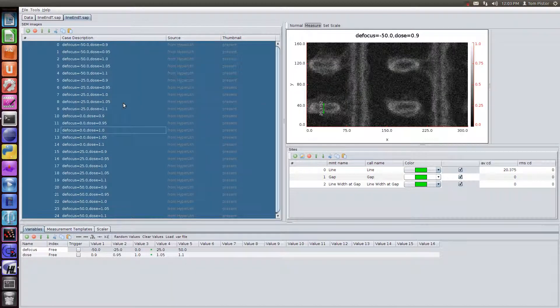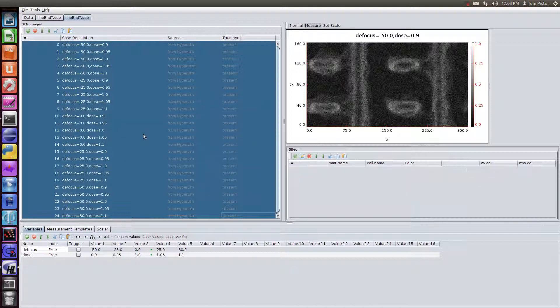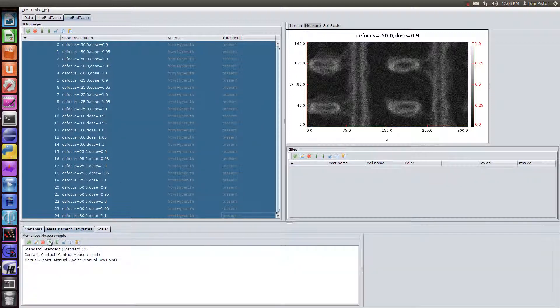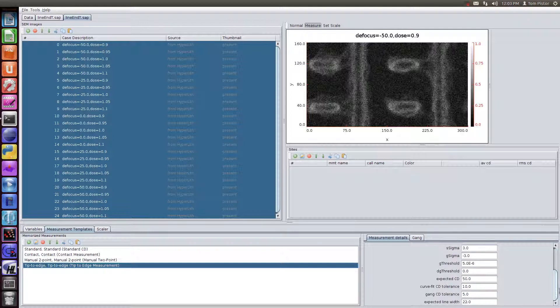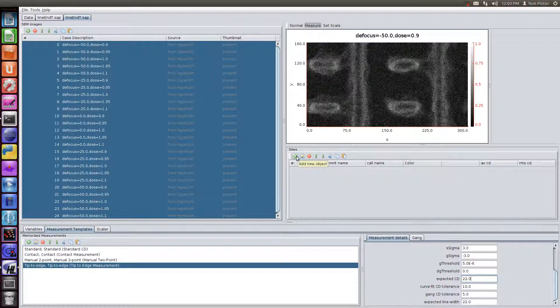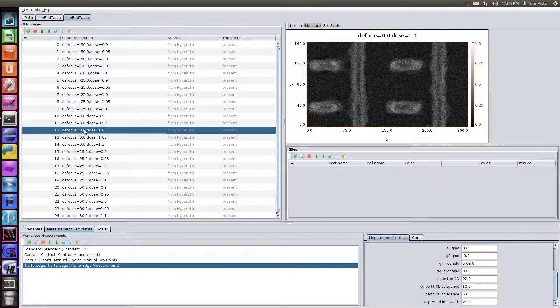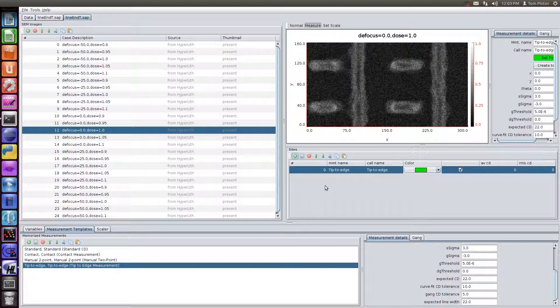So we're going to first clear out all the measurements that are on here. Then, in our templates, we're going to add a tip-to-edge template. And what we're going to do is, there's the tip, and there's the line-edge. So we're going to measure that area. That'll become clear in a second. So I'll add this measurement from the templates. I'll add it to, let's pick a particular site. Let's pick the best focus, best dose. And we'll add the tip-to-edge.